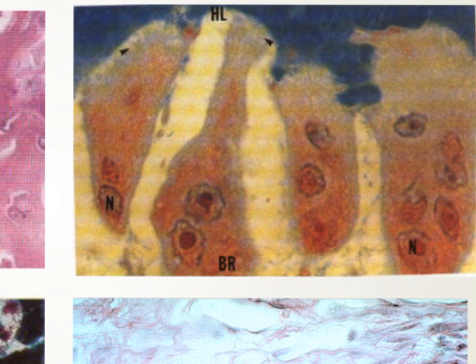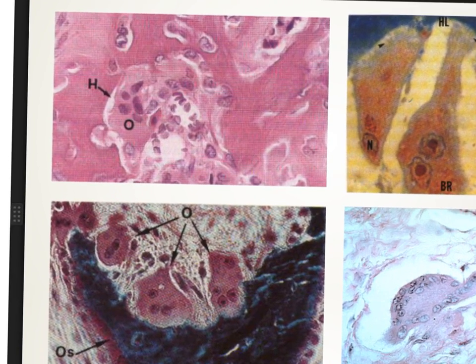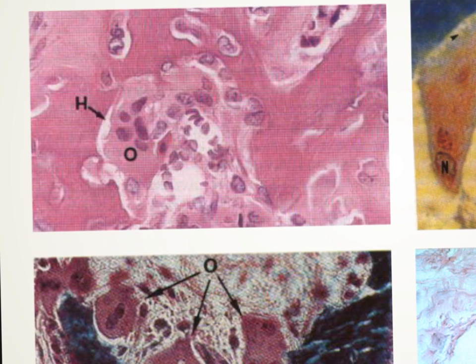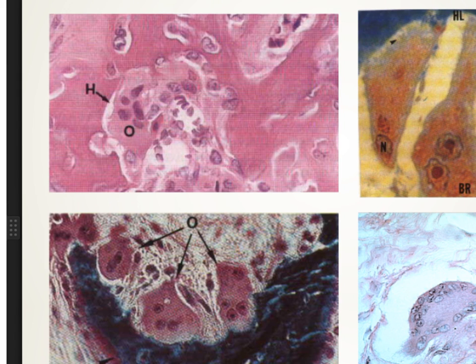So, this picture demonstrates these 4 osteoclasts. This is the bony surface, and we have here the multiple nuclei, and this cell is responsible for bone resorption and of course for bone remodeling during ossification. After that, we have another picture. We'll see it here on the left side. On the left side, we have also the osteoclast. Here we have the osteoclast.